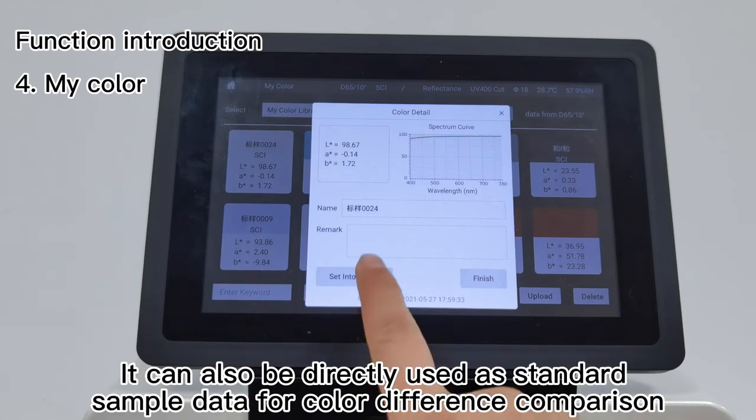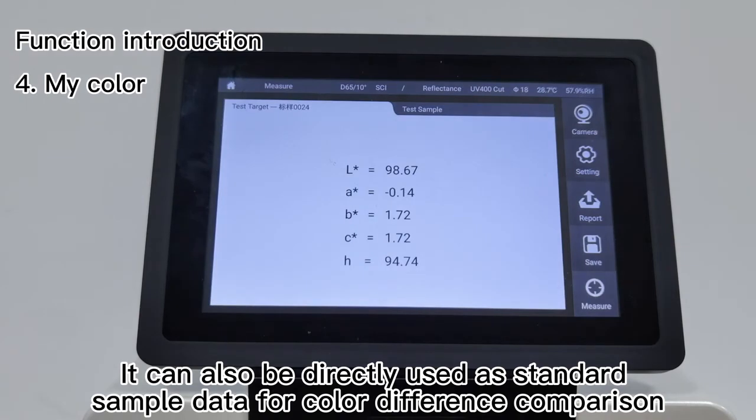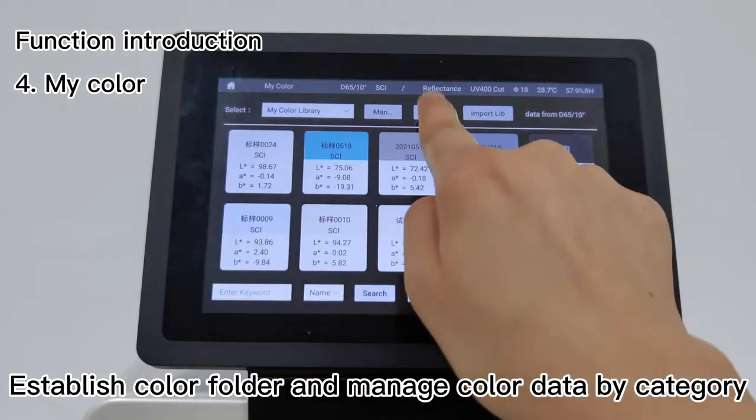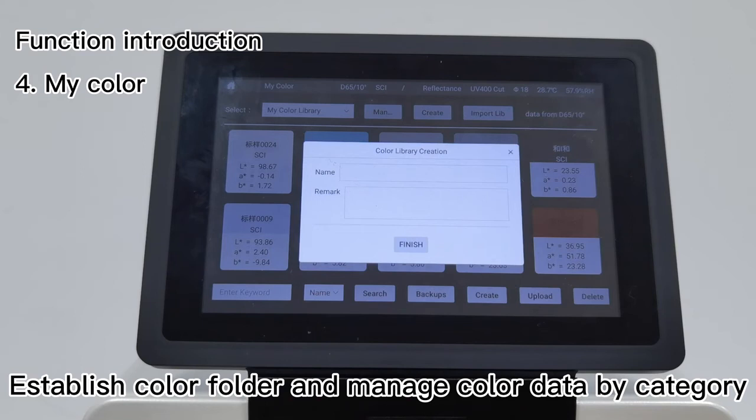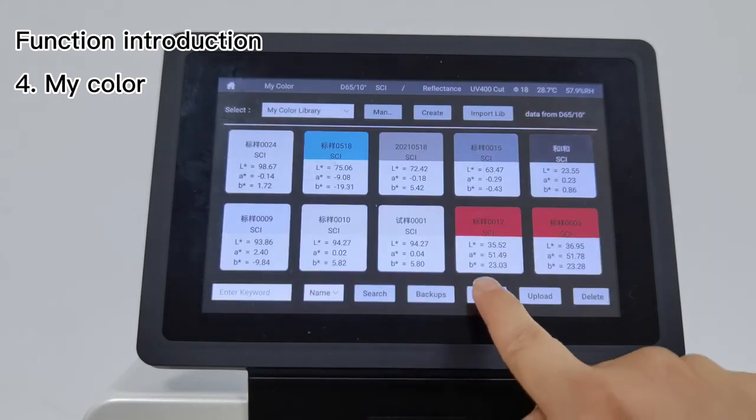Establish color folder and manage color data by category. Click create - Lab value of color can be entered manually or measured directly by instrument.